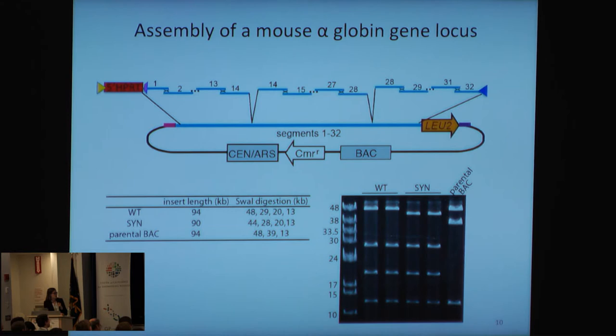And so the point of all of this is that we've developed this workflow through a need in the lab, and that's driven the work going on, or the robots we've integrated were driven by a need in the lab. And I think that's a nice model for building up the use of foundries.